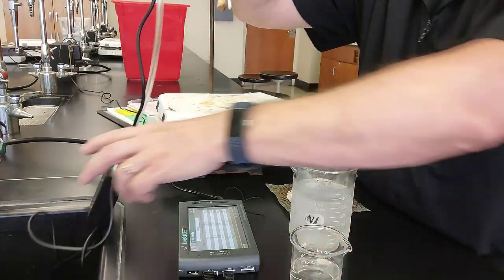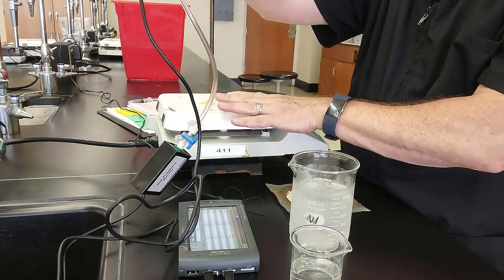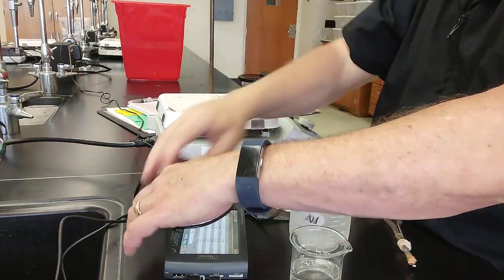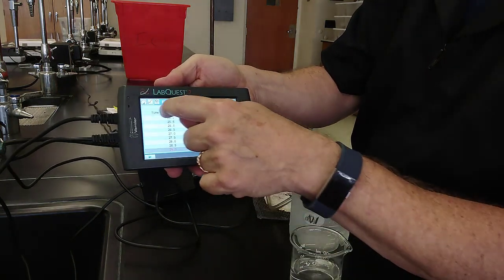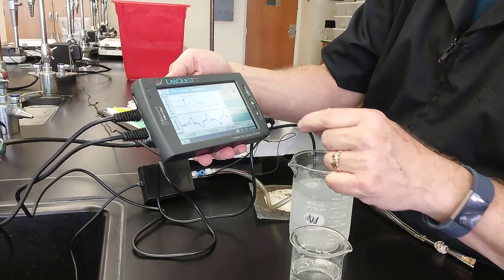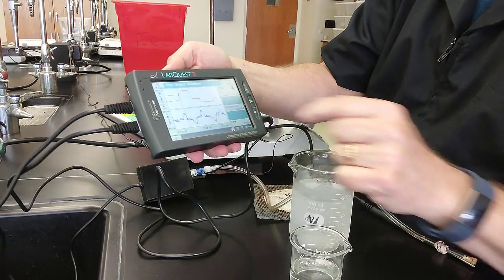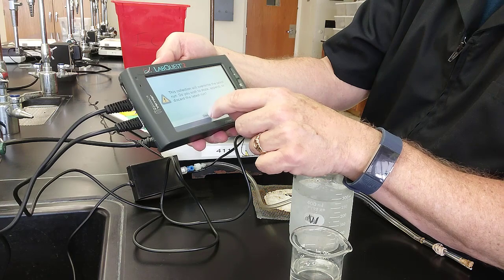Now we got to be really careful, okay? We don't want any of our hoses, any of our power cords, any of anything to contact the hot plate when it's hot. All right? So I'm going to put my LabQuest back into graph mode just so I can visually see it, but I'll be able to get my data later. And I'm going to hit go. We'll overwrite the last run. Yeah, that's fine. I can discard my data.